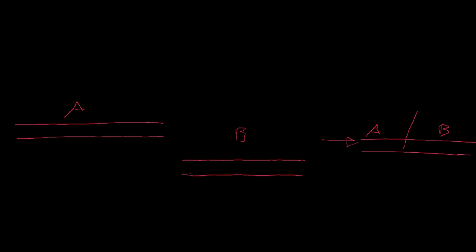So all we're going to do is, if we start off with these fragments, we're just going to add a couple of extra bits to them. And these bits are really important. So I'm actually going to extend B a little bit. So we have A and B, which are totally different pieces of DNA, and they don't have any overlap or any homology. However, you can imagine that if we were to add a little bit of homology, so if we extended A, so A now had a little bit of B, so we'll put a little lowercase b there, and B maybe had a little bit of A, or maybe it doesn't even have a little bit of A, but you know, it could, we'll just, for this example, pretend that it does.